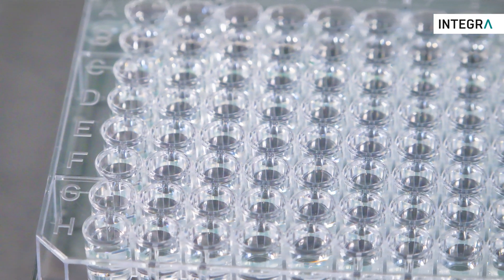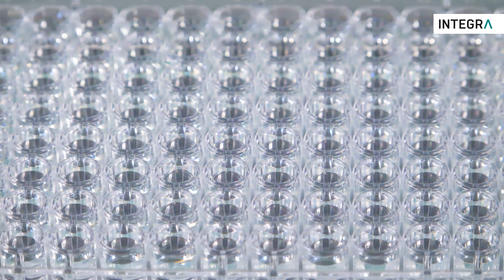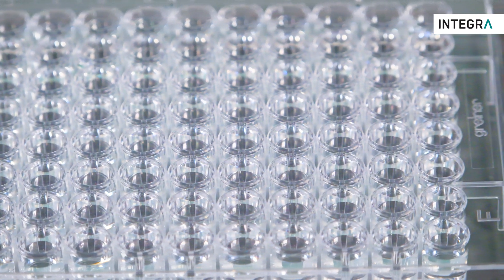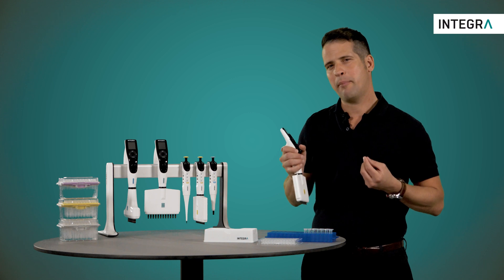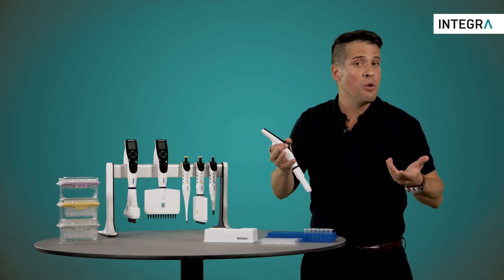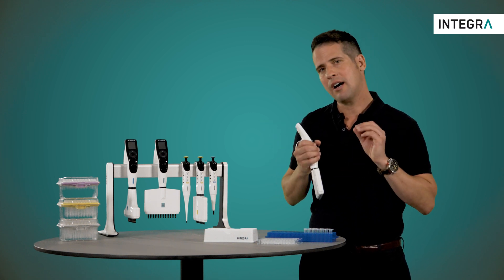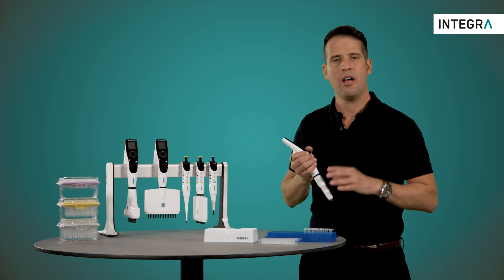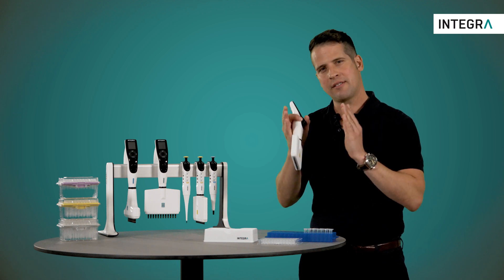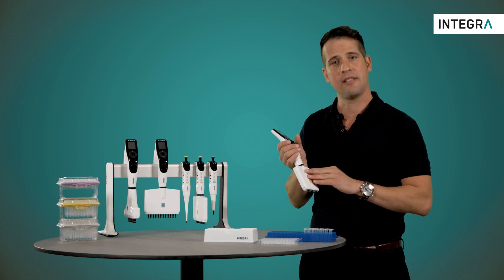Before we start, we'll assume that a 96-well plate has already been filled with a diluent beforehand. The Integra electronic pipette can also be used to fill the plate with diluent either by using a repeat dispense program, or by using a custom step-based program in which every step of the serial dilution can be defined and carried out in one simple program.